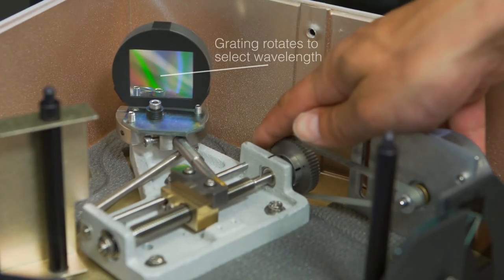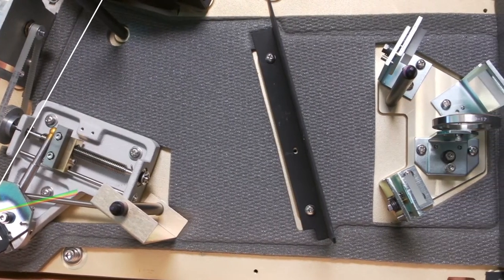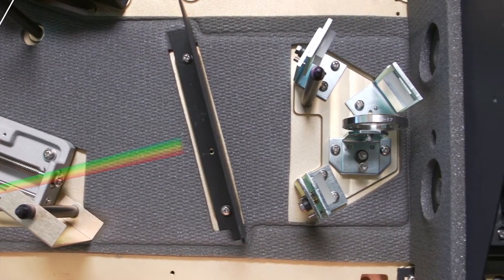The grating rotates slightly to select that wavelength. The light beam diffracts off the grating and exits the monochromator through the exit slit.